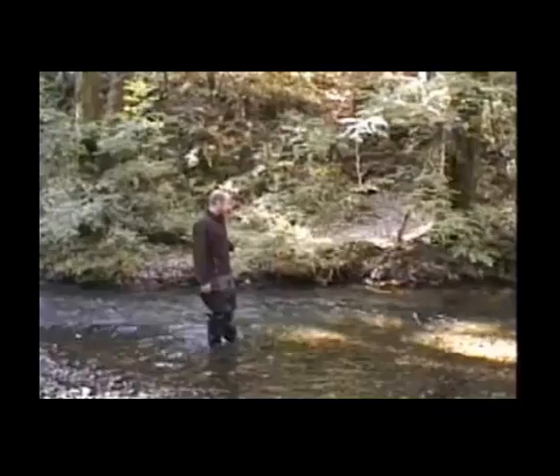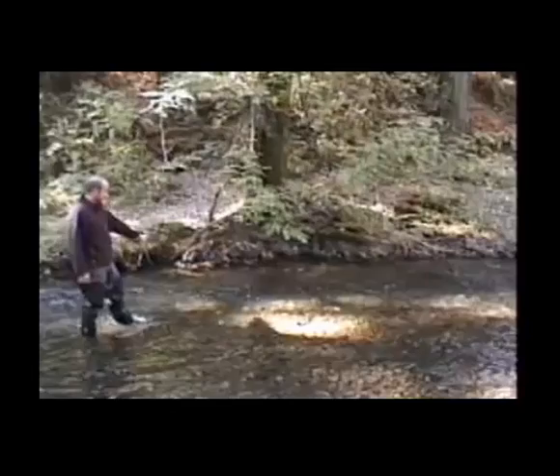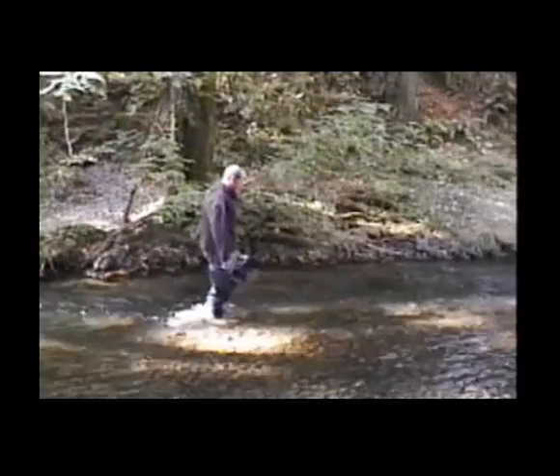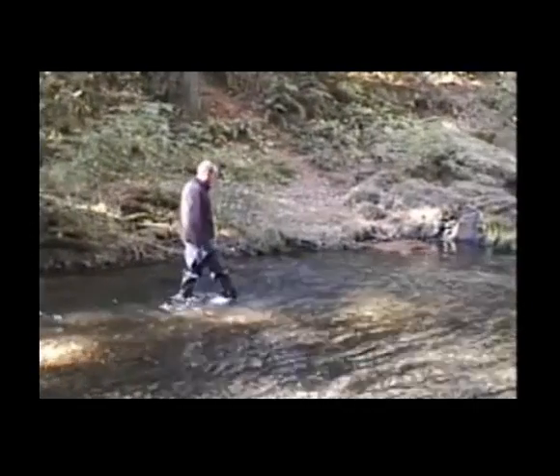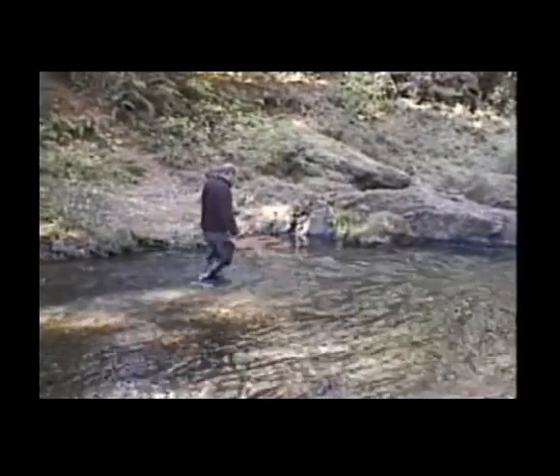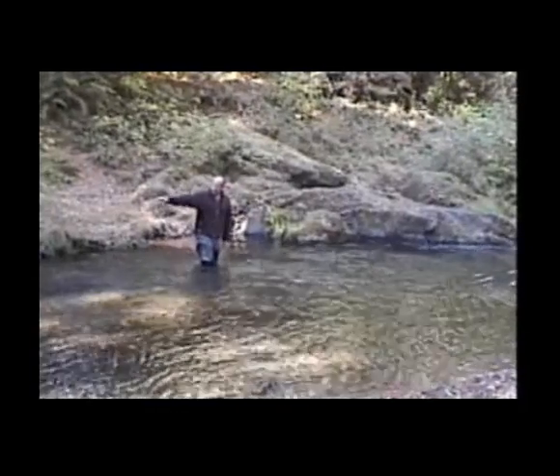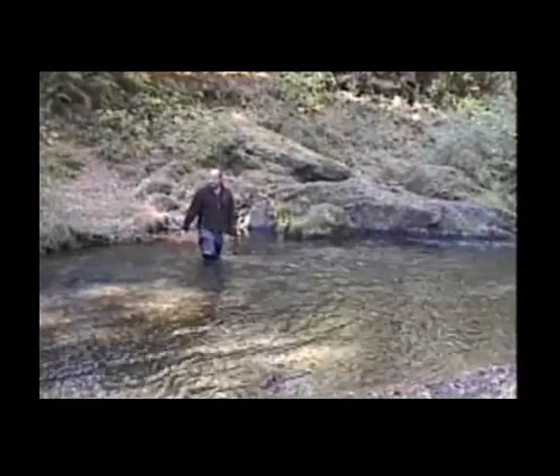Here we have a glide after the riffle where the water is still pretty swift, which is also a good thing because it's mixing the water column from various depths. And here we have more of where the centroid flow is coming from the whole stream to a deeper depth, which would probably be the ideal place to take a water sample.